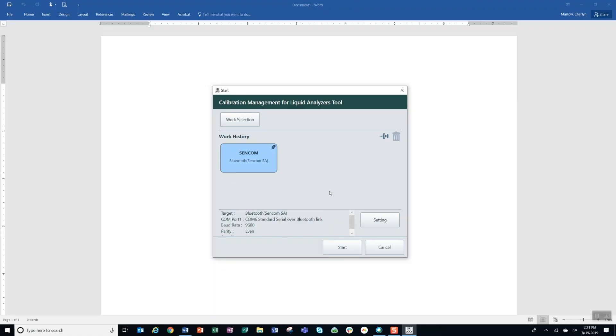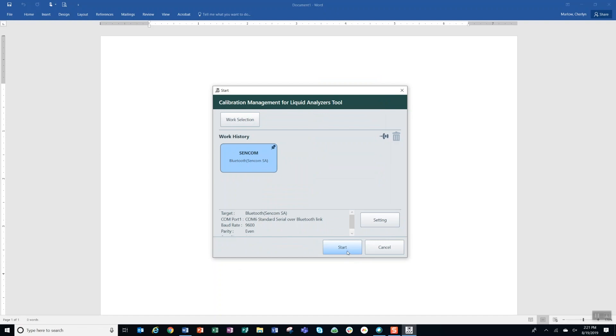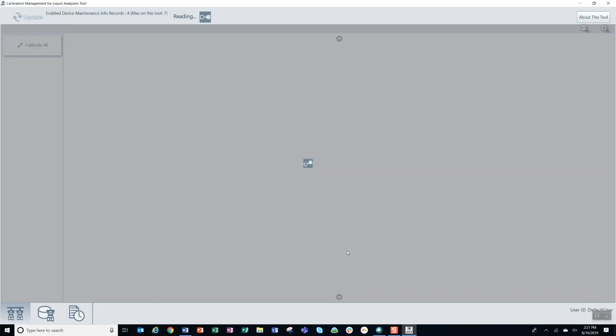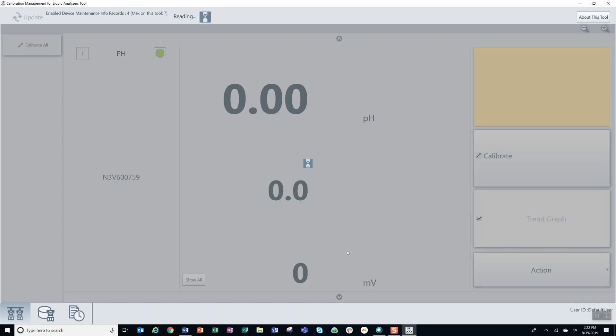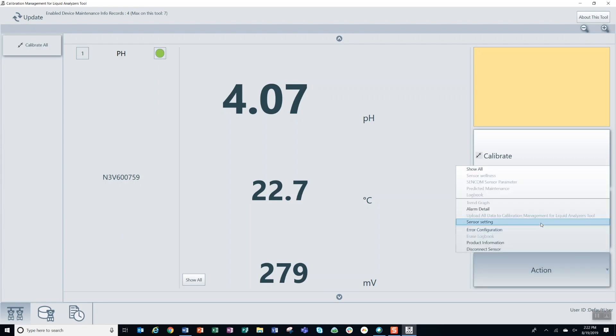Once you have your IB100 connected to your laptop, you'll open the calibration management tool. From here, you'll go to setting and make sure you have your COM port and address correctly set. In this case it's COM port 6, address 1. Then you'll click save at the bottom, and then hit the start button. Once the calibration tool has picked up your sensor, you'll go to the bottom right and click action, then go to sensor setting.